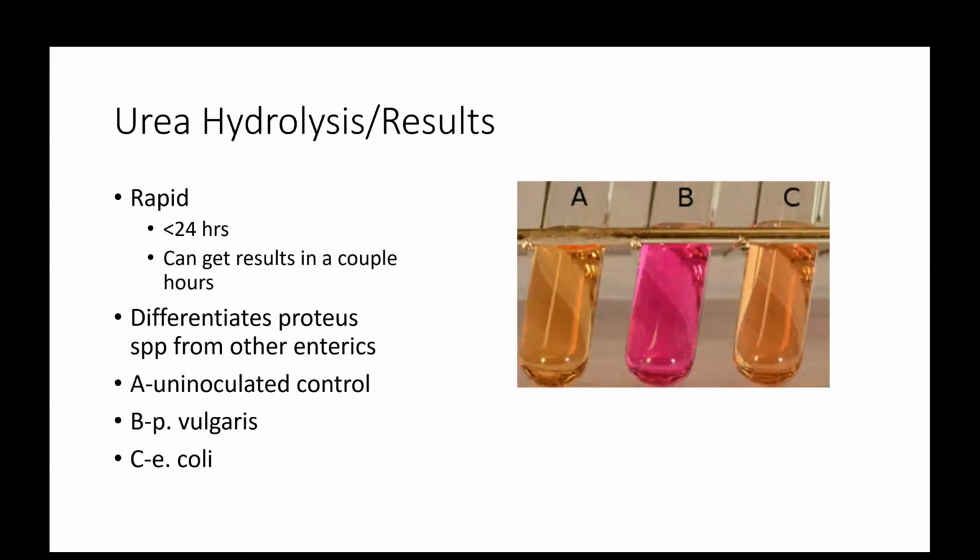So in a way, you could almost say that this is, I don't want to call it a selective media, but it's almost like an enrichment media maybe, because only bacteria that can utilize, like I would consider the citrate test and the urea test enrichment tests, or enrichment broths or enrichment media, because growth is a positive result.